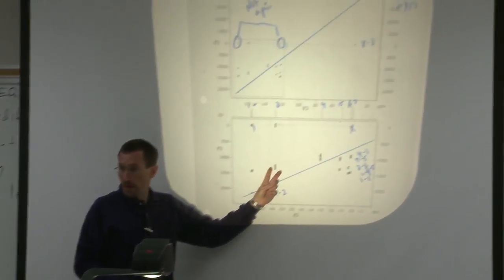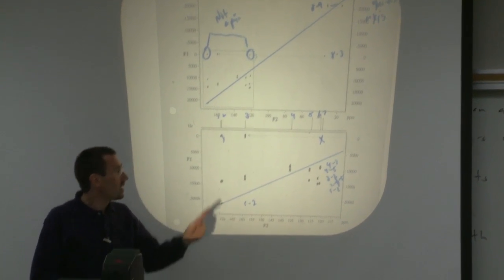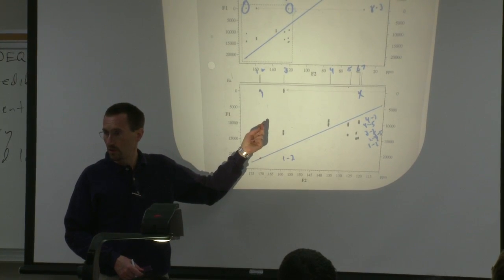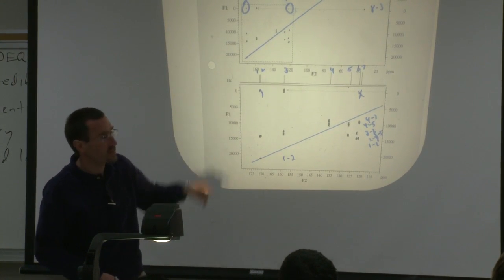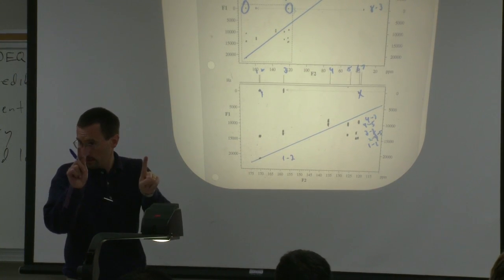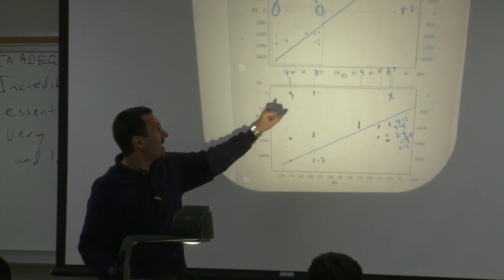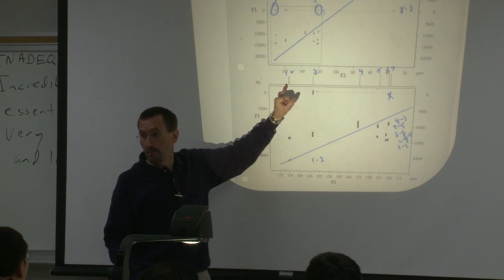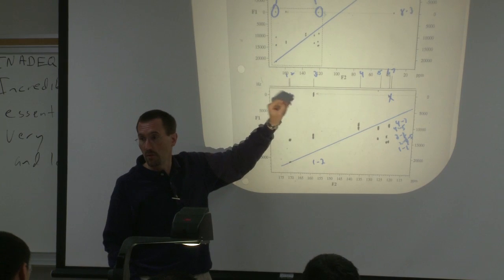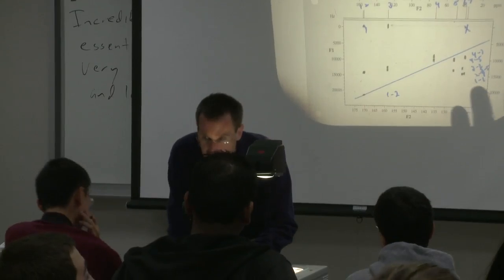Certainly, if you look at your little paired couplings, that's got to be an indication that it's one bond coupling. This molecule has a lot of sp2 carbons in it, as well as some sp3 carbons. If you had sp carbons, you could imagine even bigger spacing. That may be what we're observing here, something that's a long range type of coupling. Honestly, I don't know, but you notice we're not seeing these paired lines here, so that's kind of an indication.